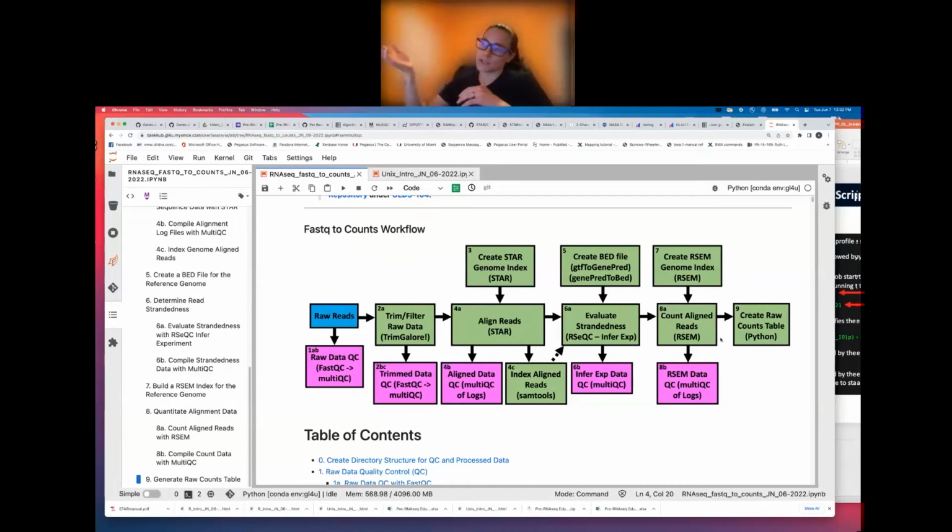Jonathan's been putting this all together in a nice workflow, so we could literally just type the GLDS number and a couple other bits of information, and then have it run from start all the way to finish, even what Lauren's going to go over for the DGE, and do the validation and verification steps after each output and actually halt the program if it runs into an issue, if it doesn't pass a V&V check.